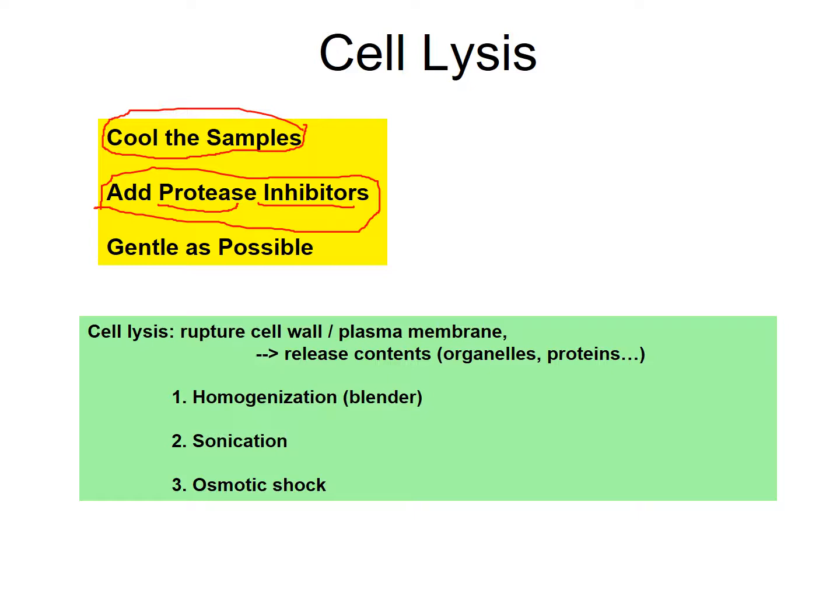Proteases are enzymes that chew up proteins. Things like apoptosis, when a cell dies, proteins are chewed up and down to the amino acid or further level. Okay, in the body, those would be potentially released and used by other cells, organs in the body. So there are actually other proteins or inorganic molecules that may bind to these protease active sites, shut them down, inhibit them. And you need to be as gentle as possible.